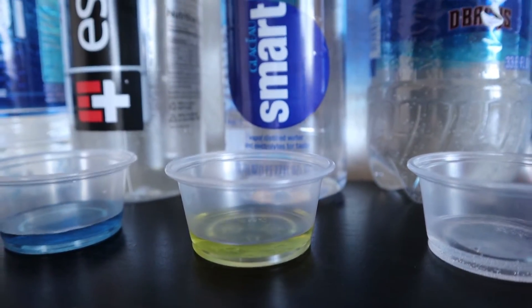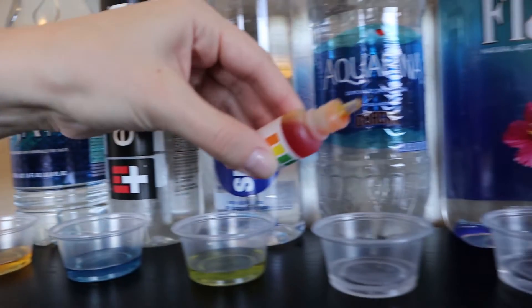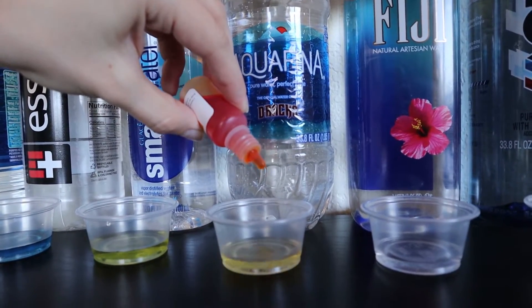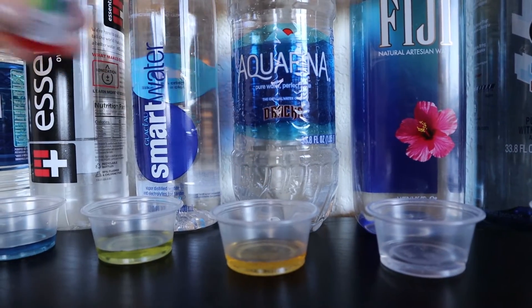Now moving on to Aquafina. Aquafina is a product of Pepsi, a rival to Coca-Cola, also on the acidic side. I'm going to give it a 4.5.